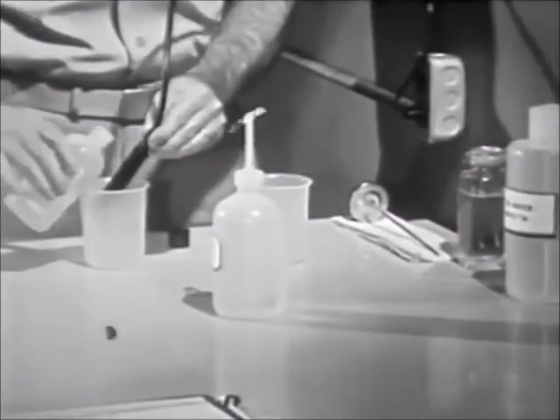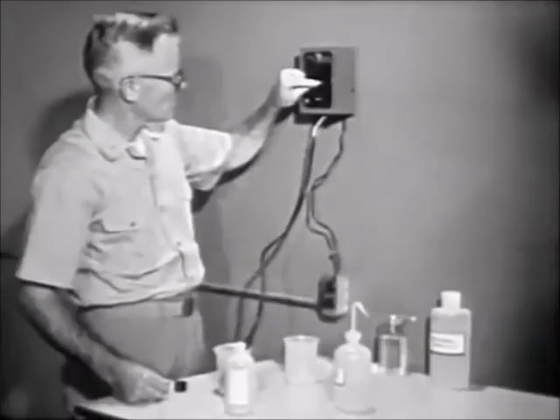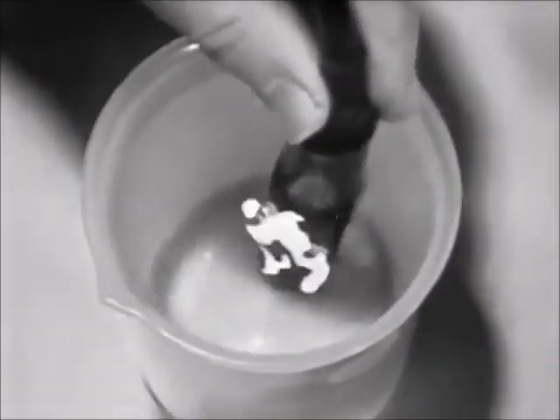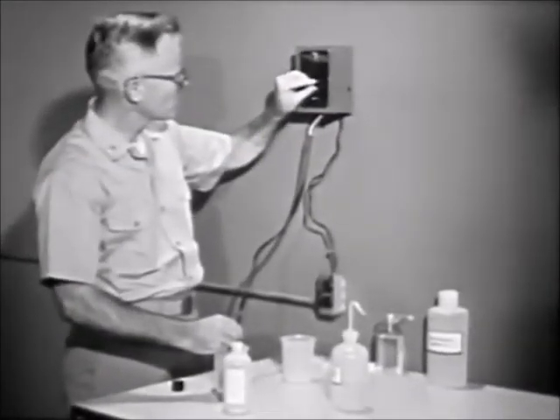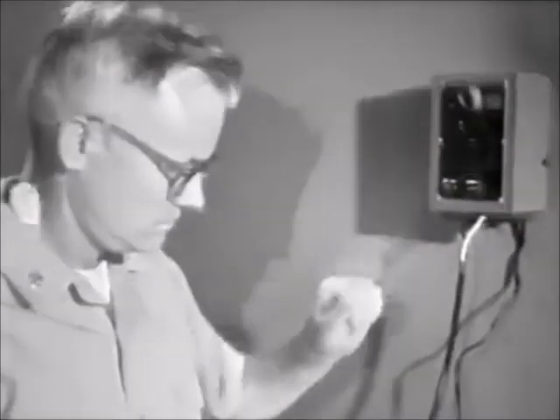During periods of normal operation, it is extremely important that the meter and cell be tested with standard conductivity solution at least once every three months to ensure accuracy of testing results. By carefully and accurately performing the conductivity test, you will be able to detect dissolved solids before they have a chance to seriously damage your ship's boiler.